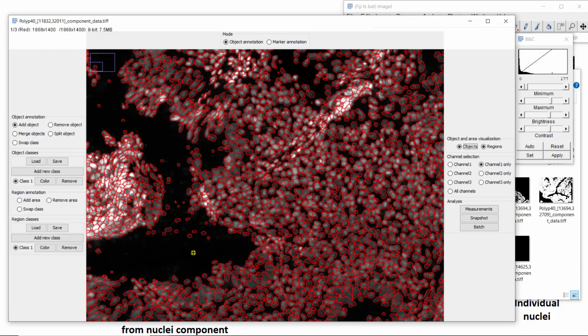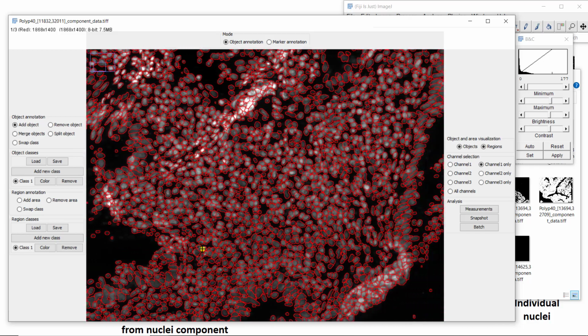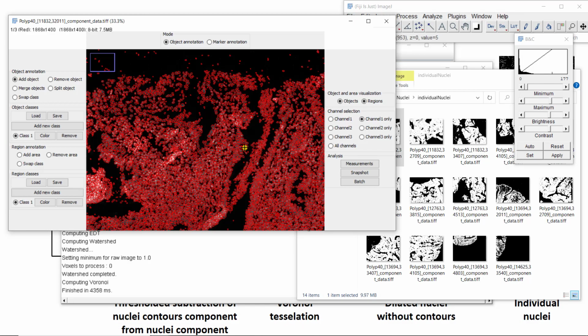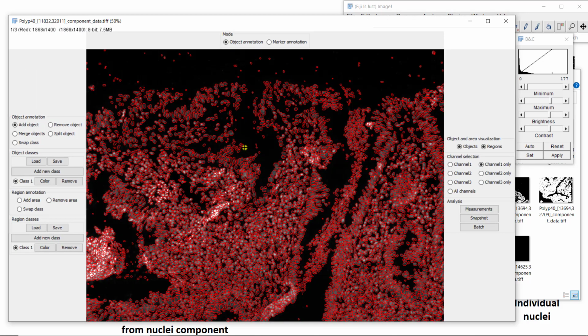If we move to, let's try to find more epithelial cells. It's okay. It's certainly not accurate all the time, but it does a pretty good job. So when you look at it, with just 4 images, training is extremely fast. With just some post-processing with an image macro, we already have pretty interesting results.